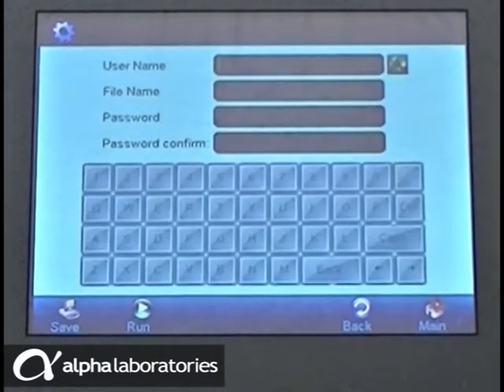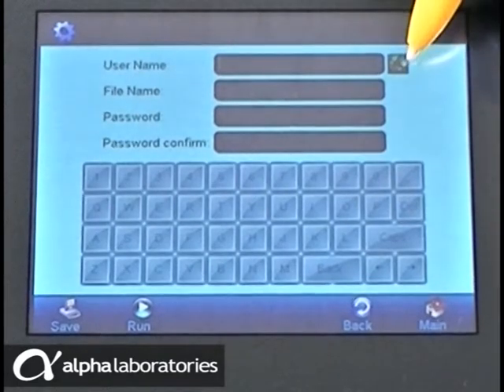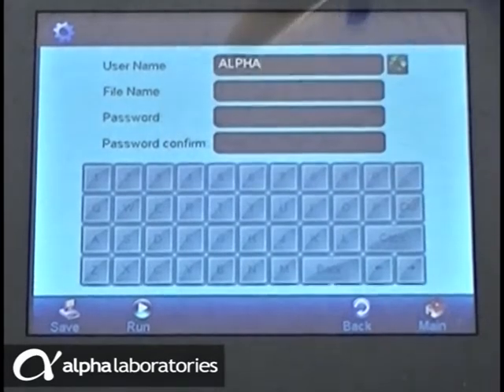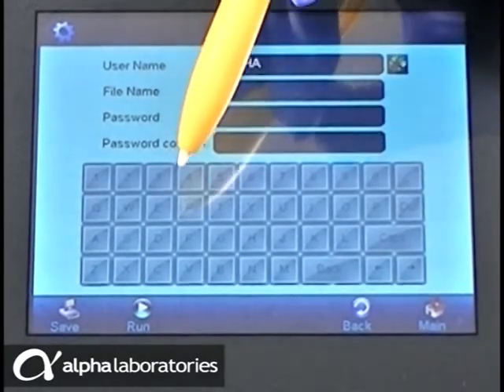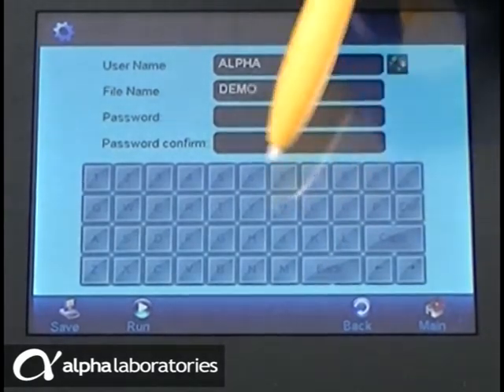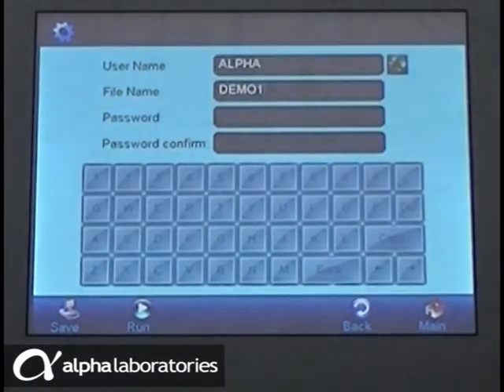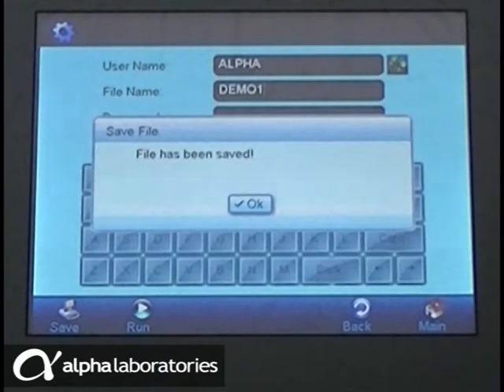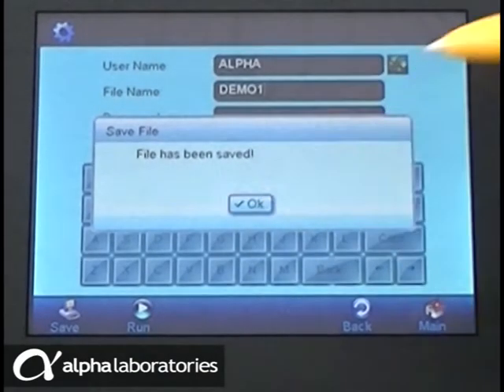Once you are happy with your method setup, touch Save Run. Enter a new user name or select an existing one. Create a recognizable file name. You can also opt to password protect your file to prevent modification by other users. Touch Save. Up to 250 programs can be saved directly on the machine and an unlimited number externally on a network or PC.